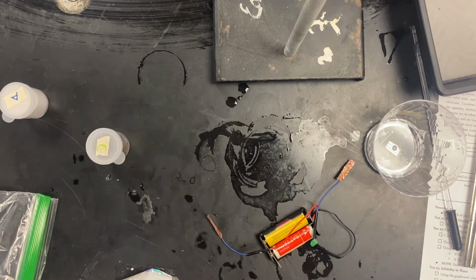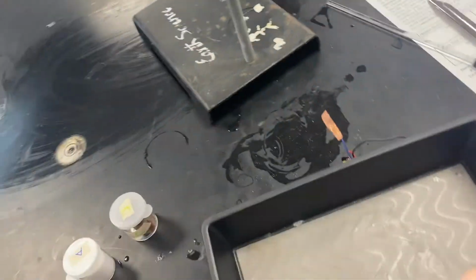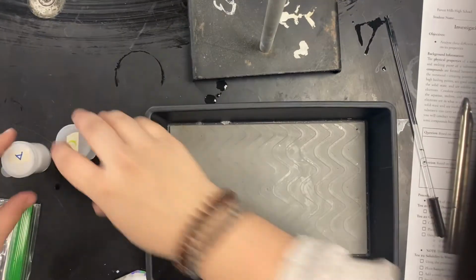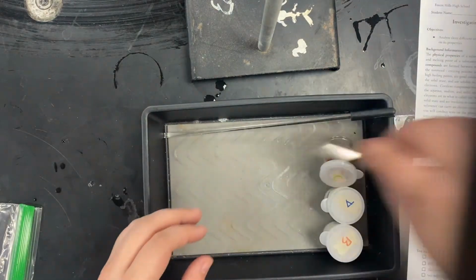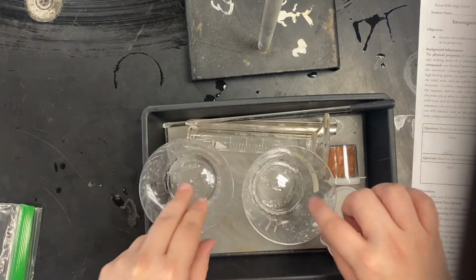For cleanup, what you're going to do is take your cups, give them a nice swirl and a rinse, both cups, and make sure all of your caps are on. We're going to throw everything back into your bin: your stirring rod, your scoop, your graduated cylinder, your 2 cups.